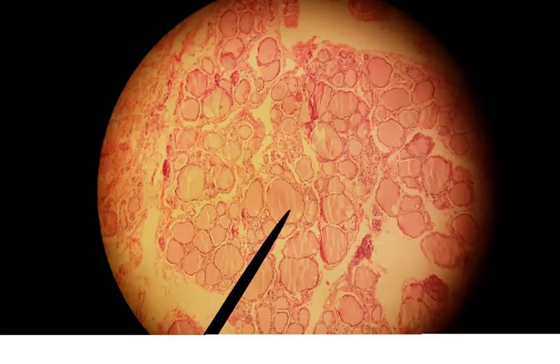This first slide is of the thyroid gland and I'm not going to cover very many of the aspects of hormones, what they do, and their stimulus for release or anything like that. That will come from the chart that you need to fill out. Right now I'm just going to go over the major points for each of the slides that you'll need to know. On the thyroid gland there's going to be these large kind of round structures and then there are going to be the parts that are not within those round structures. So those are our two major regions.